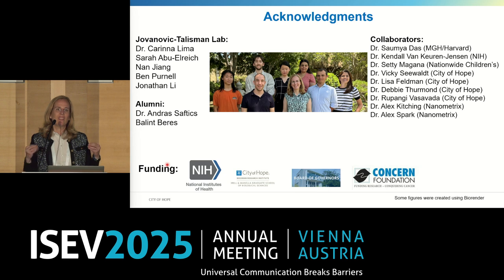So there is no right answer for this, but there are some things that I always consider. NTA doesn't really consider those smallest particles, and doesn't distinguish between aggregates and EVs. So that's a challenge. When I do super resolution microscopy and I have affinity labeling on top, I really can know that I have a particular kind of particles, but I am often looking at a subpopulation. So I can tell you that you have to look at the range.